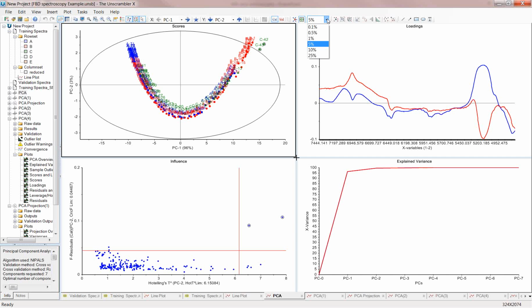Two standard deviations is 80-something. And then at 1.96 standard deviations away, you have 95% of your information that should fall within that range. It's the same thing. Hotelling T-squared is that same kind of limit, but in multivariate space.